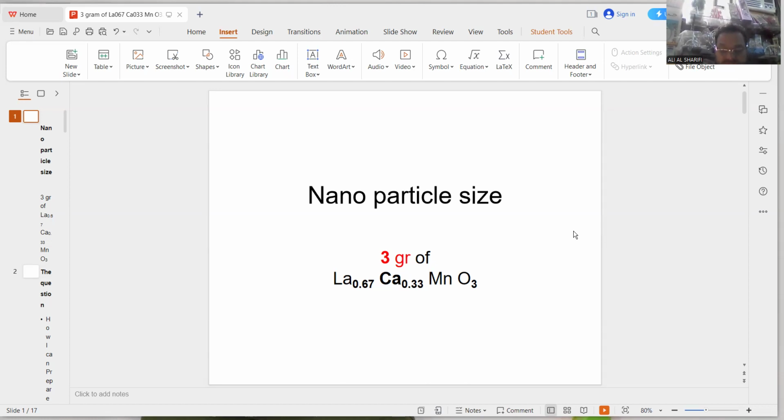Okay, what are the necessary parameters? I must prepare it to start at hydrolysis in sol-gel. Hydrolysis, like I explained before, is the first step in sol-gel. What is necessary? I must put in the glass two solvents, pure water and hydrochloric acid, like in my study. All of these are not organic.